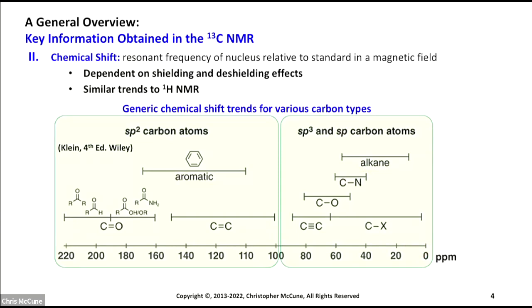So hydrogen that would be attached to that carbon would show up in a very similar spot in terms of being further to the right. And so when we talk about upfield and downfield, the more right you go, this is more upfield. And the more left is more downfield.